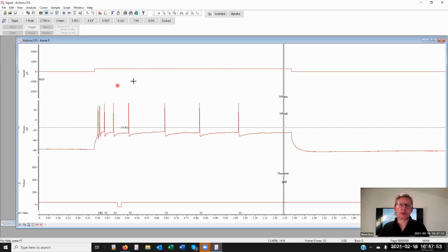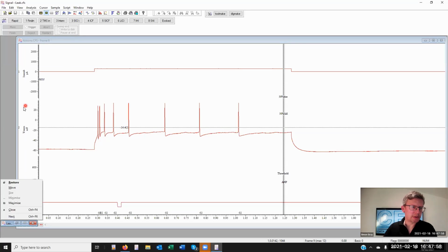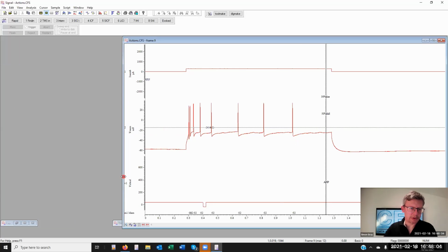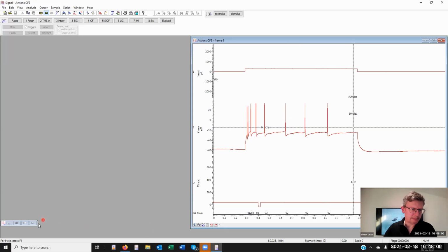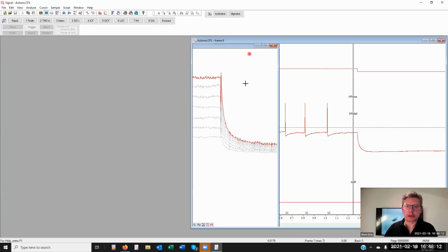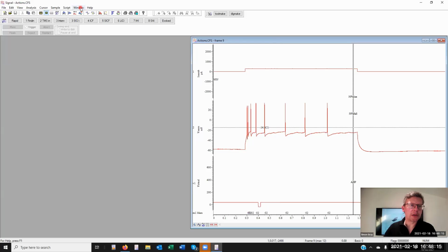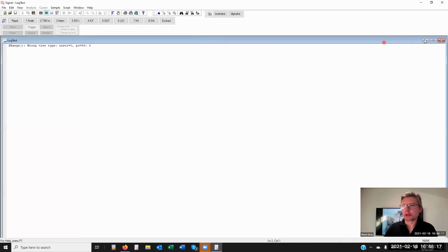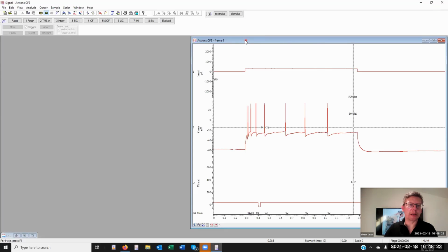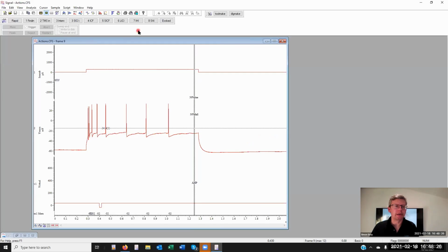Okay, now just to speed things up a little, I'm going to just tidy up a little, and I'm getting rid of a couple of data files here. Here is the log, the leak. I should say the only window you cannot close is the log view, which is always there in Signal. So it's a clipboard to which we could print various values from a script or from cursor regions, dialogues, etc.